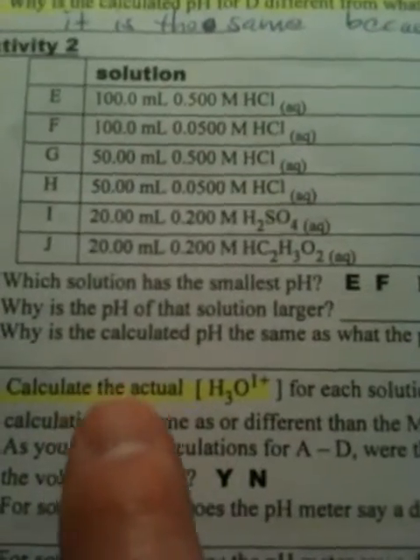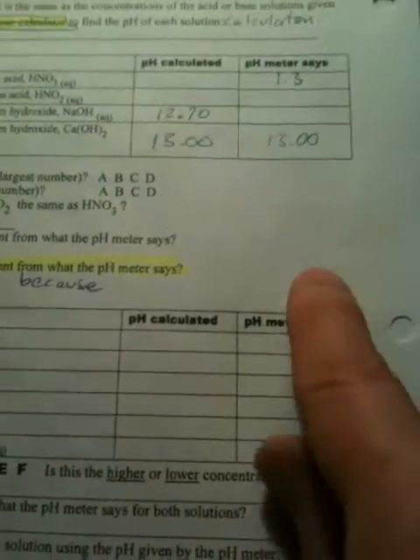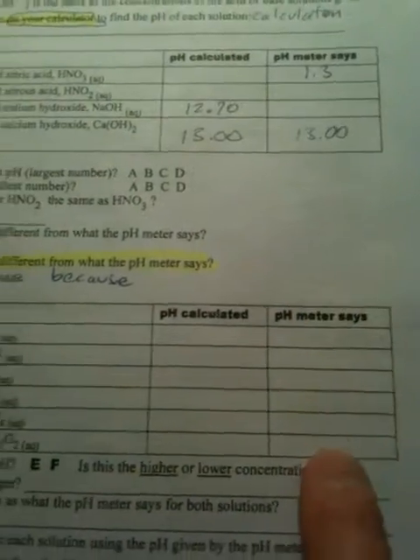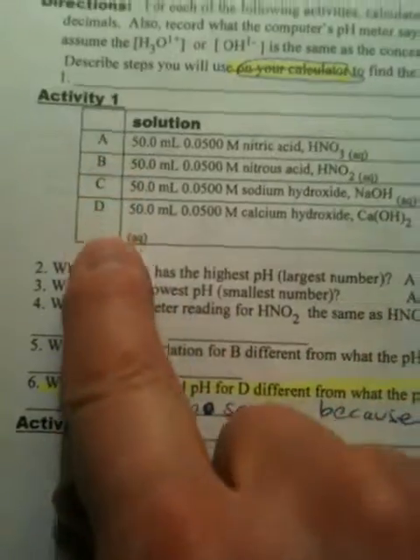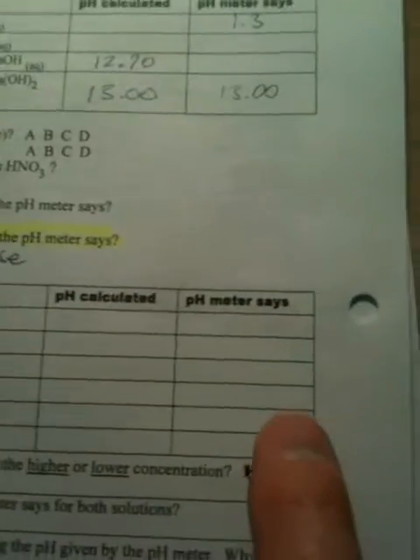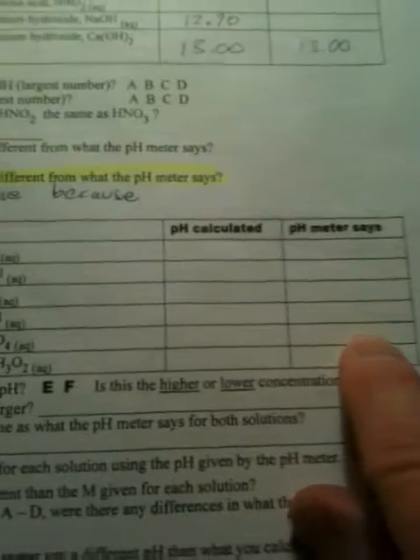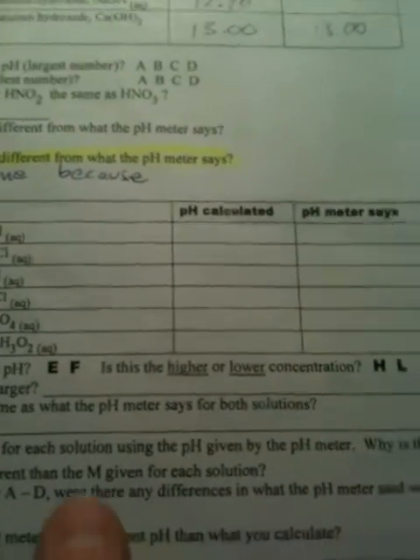Okay, so they're both the same thing. So I'm going to calculate the actual hydrogen or hydronium ion concentration for each solution. What is that, each solution? That's all of these. That means we go from letter A down to letter J, taking the pH numbers that we got off the meter and figuring out what the hydrogen ion concentration is.